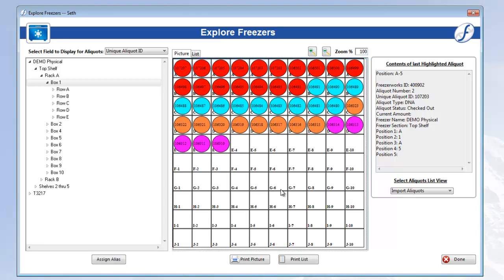And that's all we have for today. The Print Labels form is pretty simple. It always works about the same way. But hopefully you learned a thing or two about where you can print labels in Freezerworks. Remember, if you need help creating your label formats, see part 1 of this series.